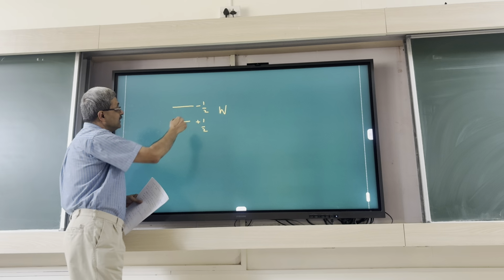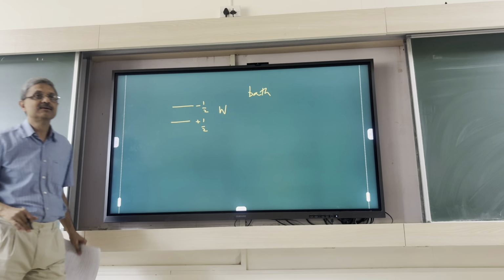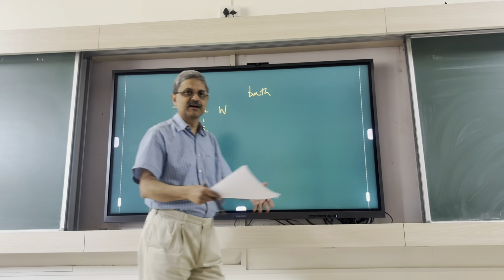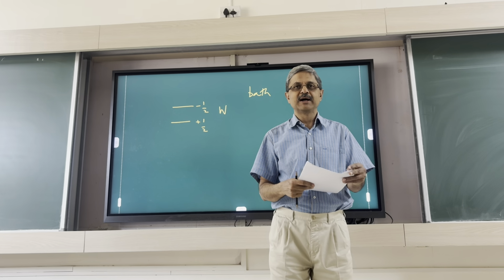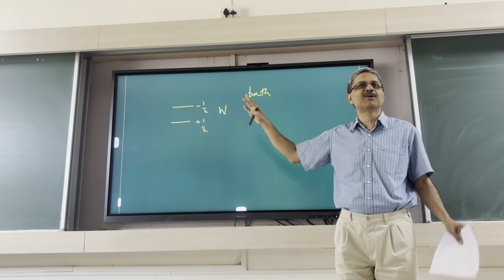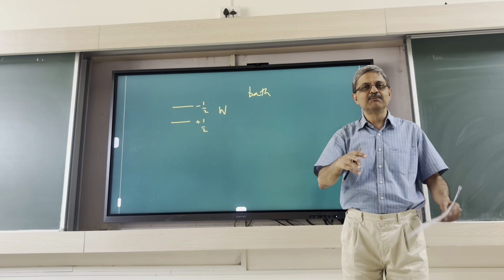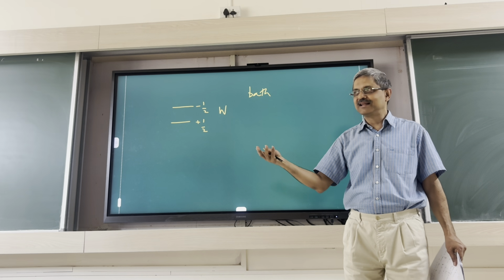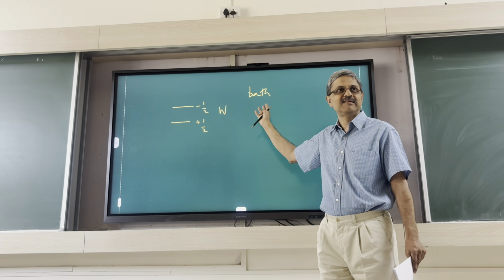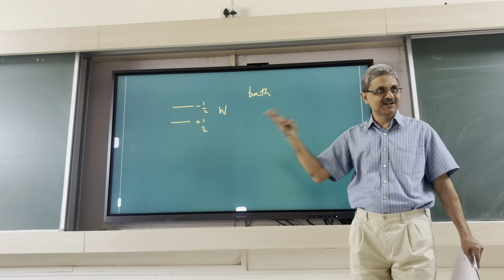But all these nuclear spins are also there in a reservoir, right? So one question: I have nuclear magnetic moments. If I don't apply a field, there are no two distinct states, and there is equal population of plus half and minus half. When I apply a field, some should get polarized, right? But then there must be some connection with the reservoir, since ideally the populations are not equal at a particular temperature. How that comes about is what we want to see next.